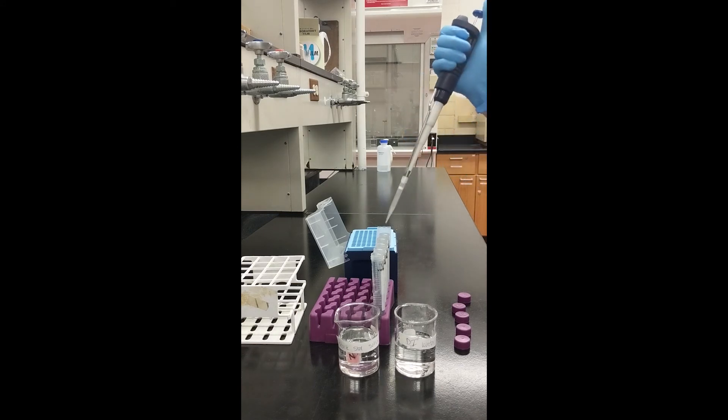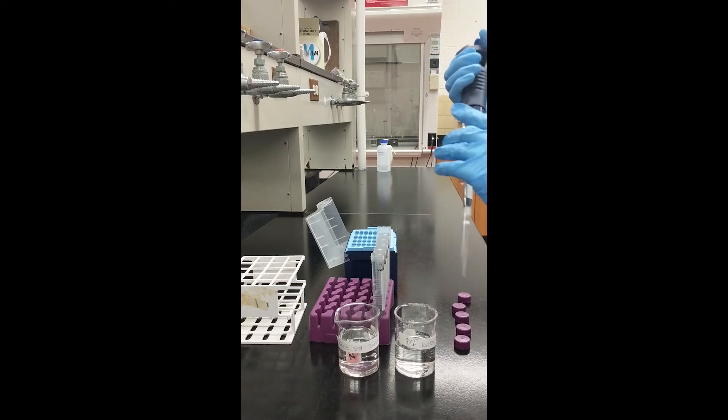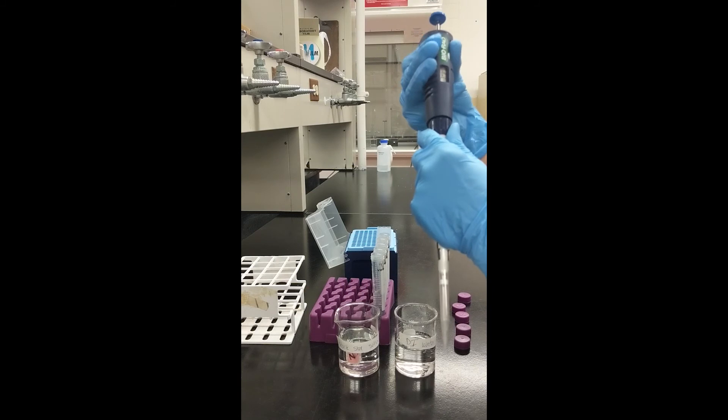Continue pipetting into tubes until finished. You may need to adjust the volume of the micropipetter during your preparation, as shown.